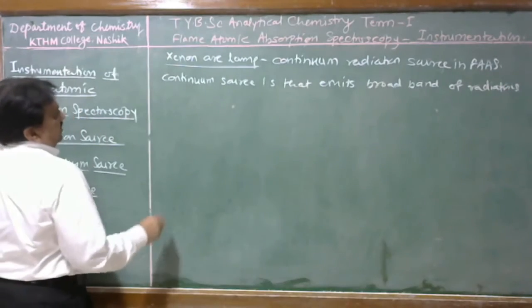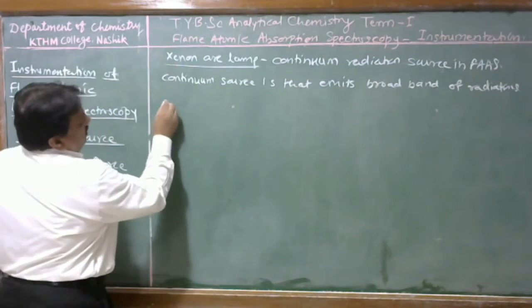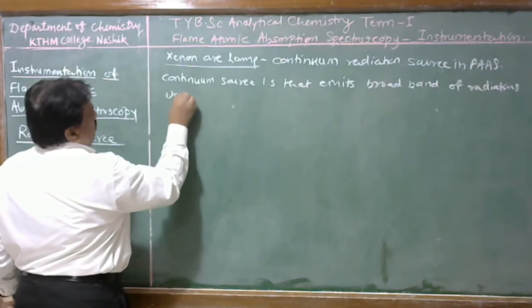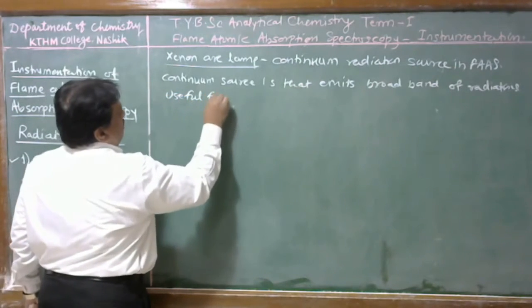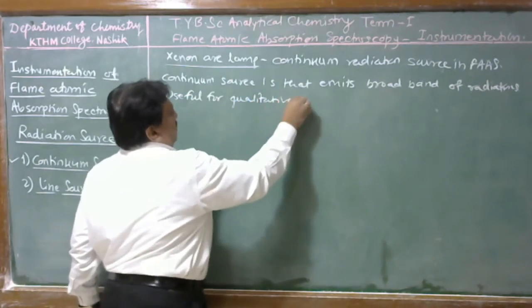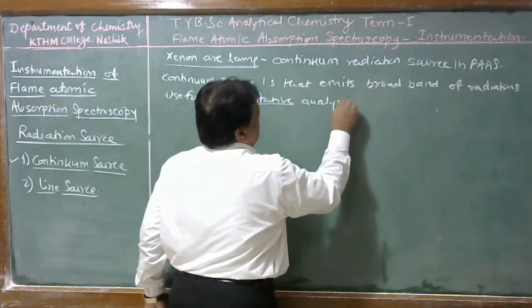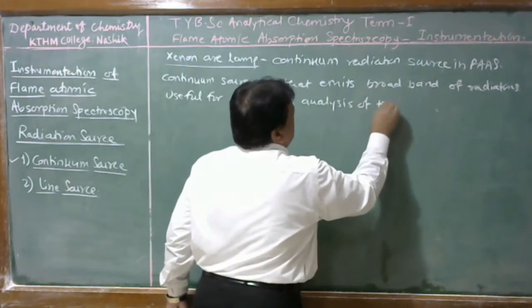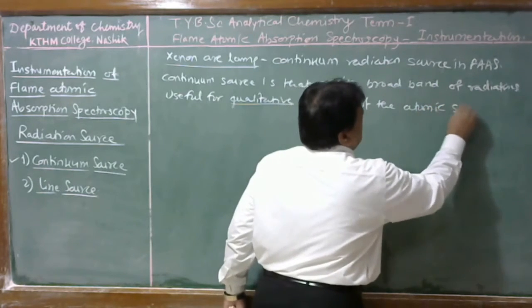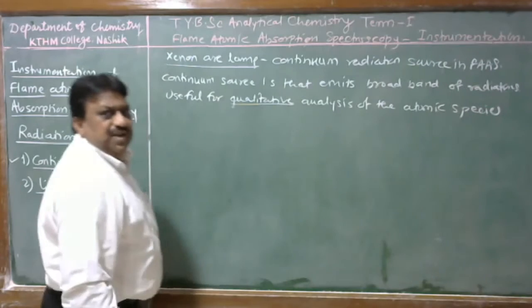These radiations can be useful for qualitative analysis, that is, identification of the atomic species present in the flame.